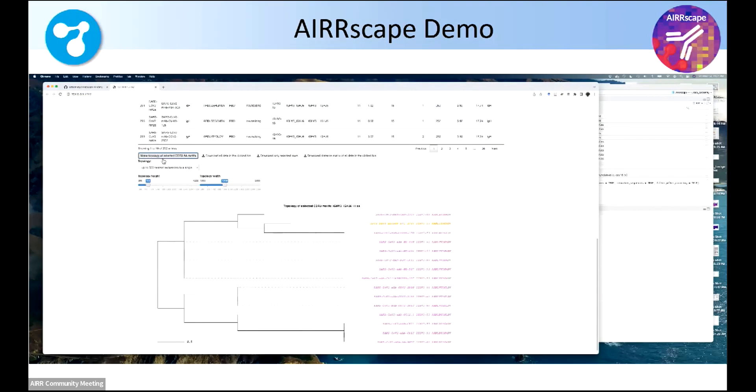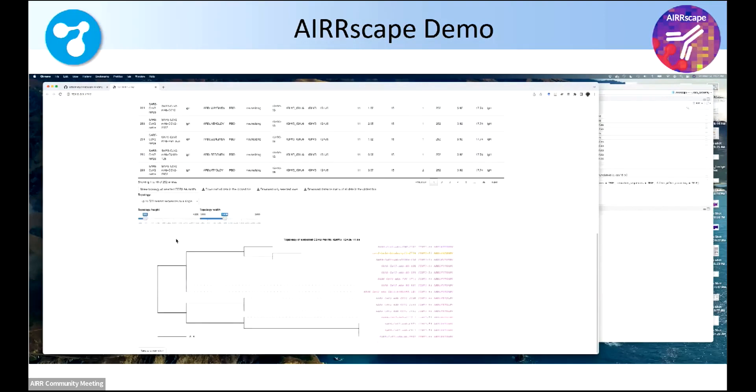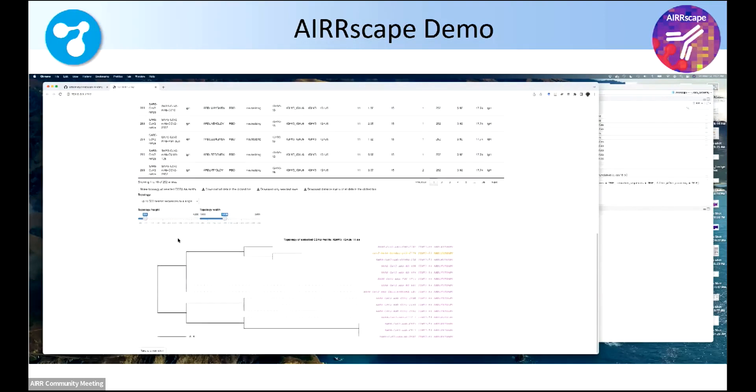They're color coded, in this case, by data sets. So all the purple are all the covabdabs. So again, many different, there's convergence because there's many different studies in that data set. But then there's also an orange there that's one of the bulk patient repertoires.